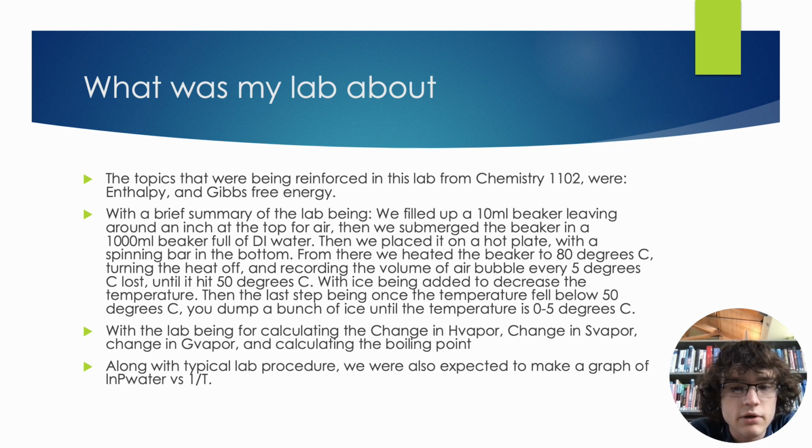With the lab being for calculating the change in H vapor, change in S vapor, and change in G vapor, and calculating the boiling point. Along with typical lab procedure, we were also expected to make a graph of ln P water versus 1/T.